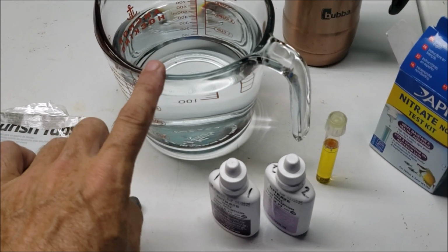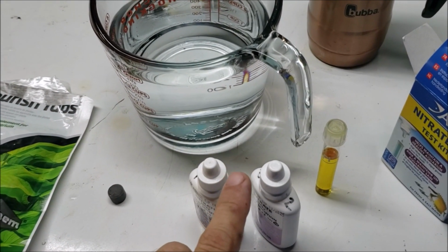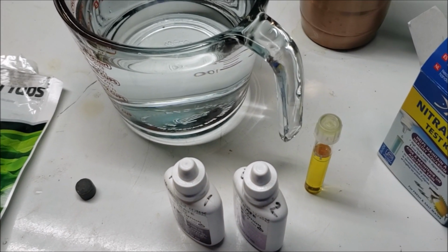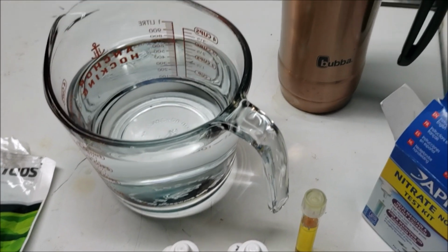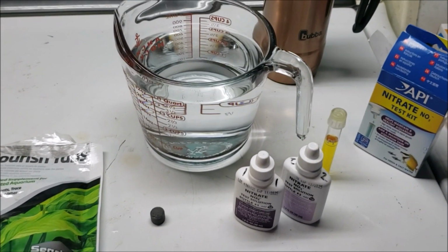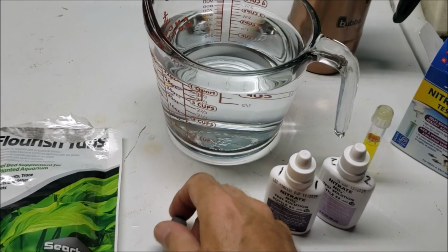This is RO water. This is my nitrate test kit. This is my nitrate test that we just did that indicates there's no nitrates in there whatsoever. And this is my coffee, which has nothing to do with this video whatsoever. So we're at a 0 nitrate level.